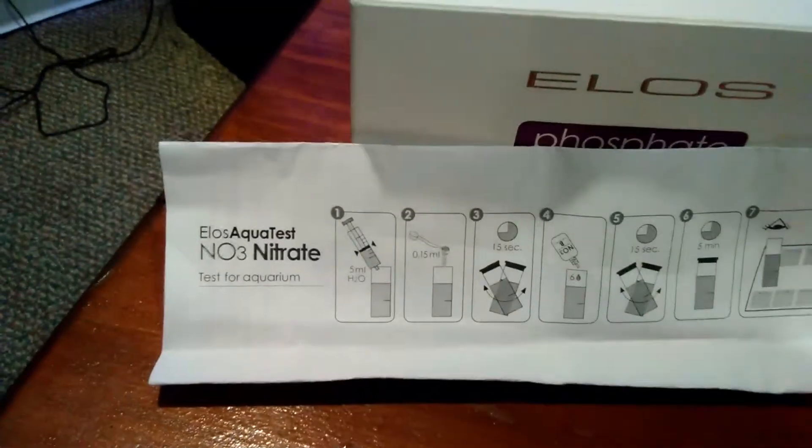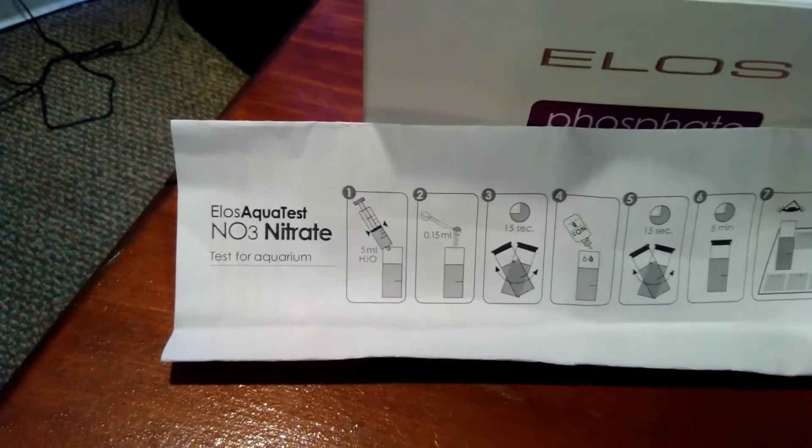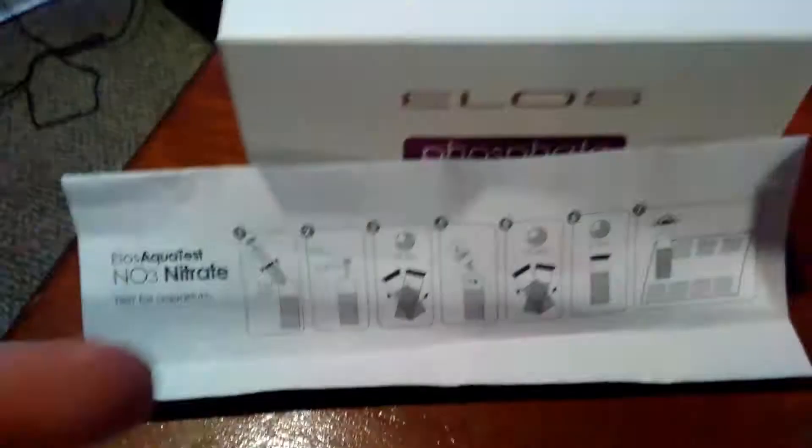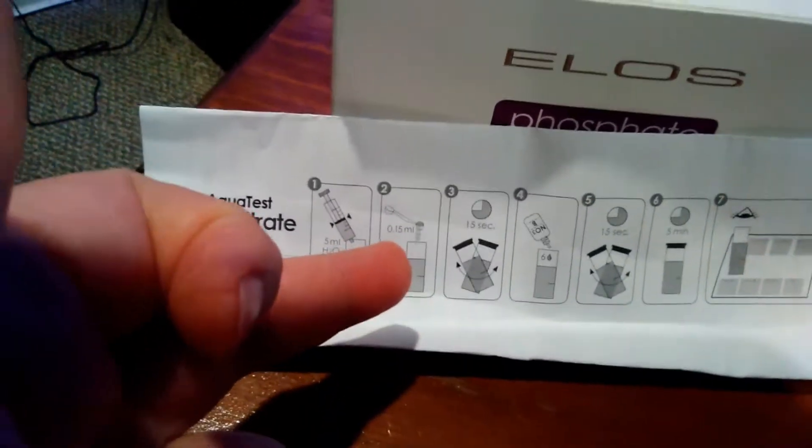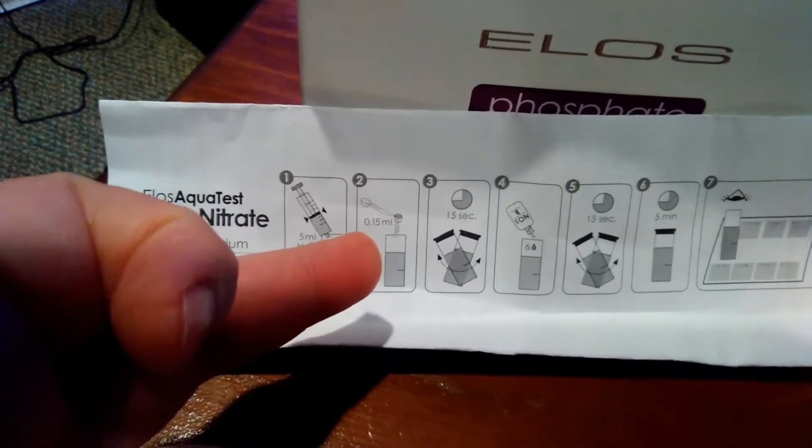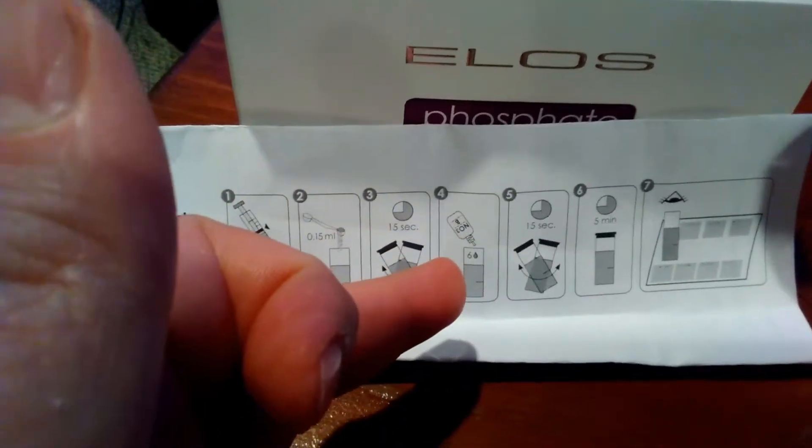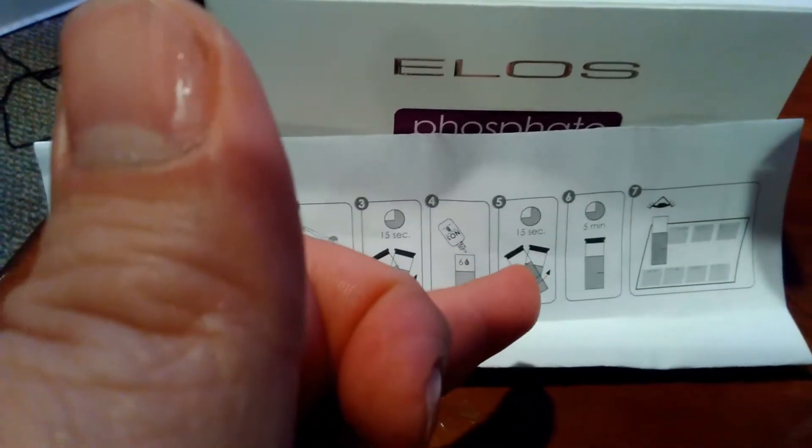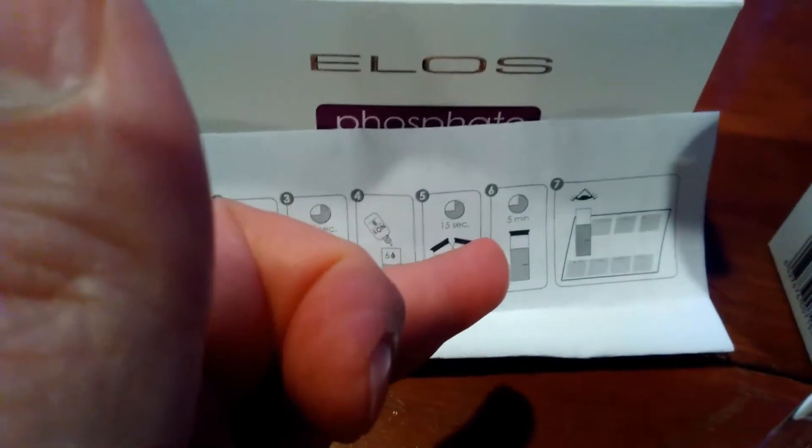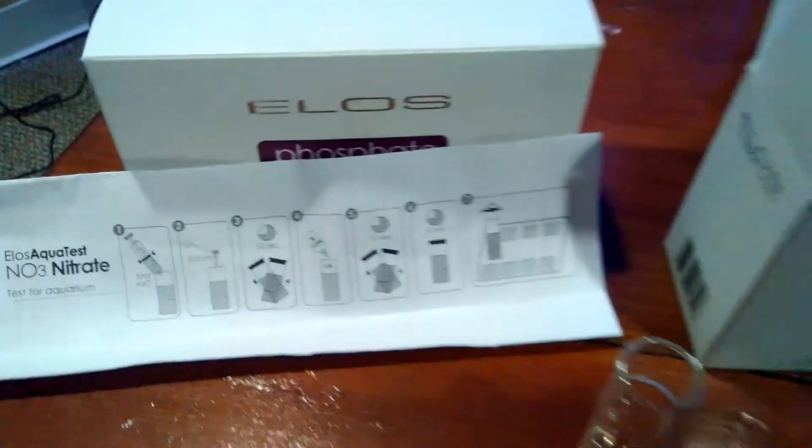Here's the instructions for it. You got your 5 milliliter syringe, 0.15 milliliter side of the spoon. Shake for 15 seconds, 6 drops, another 15 second shake, 5 minutes. Now you got your test.